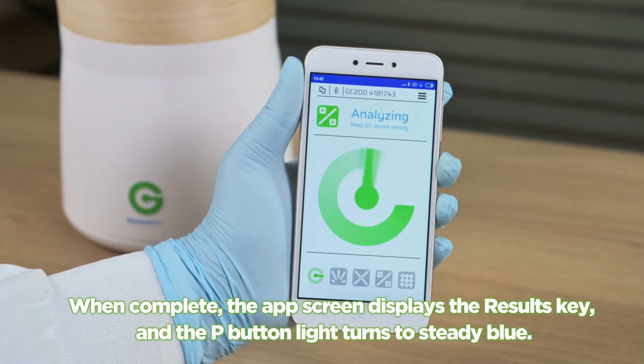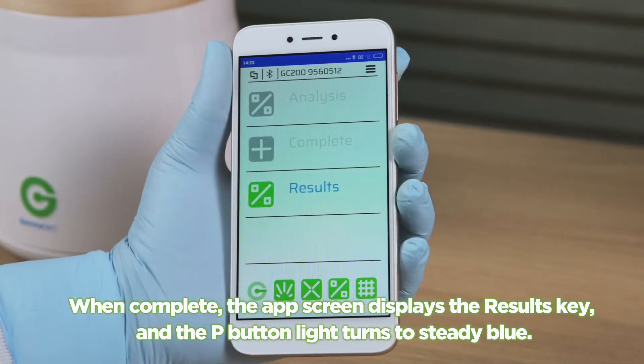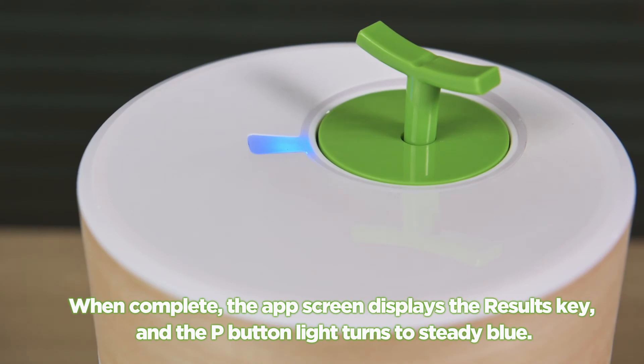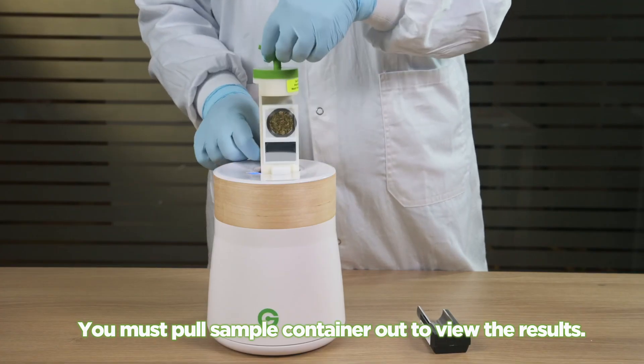When complete, the app screen displays the results key and the P button light turns to steady blue. You must pull the sample container out to view the results.